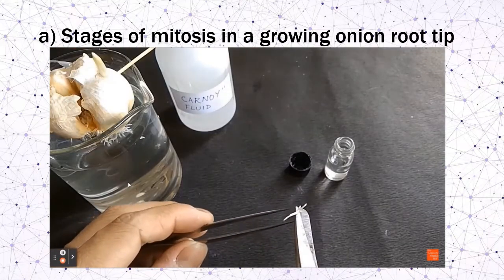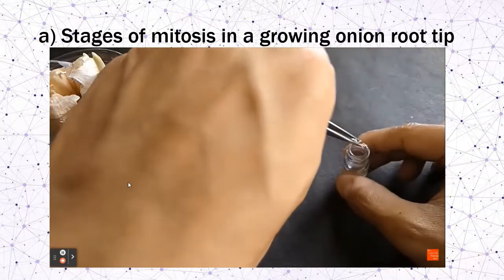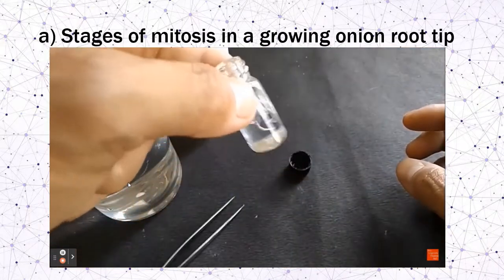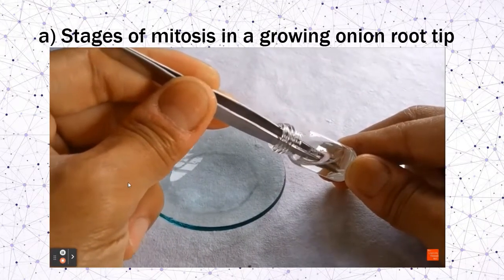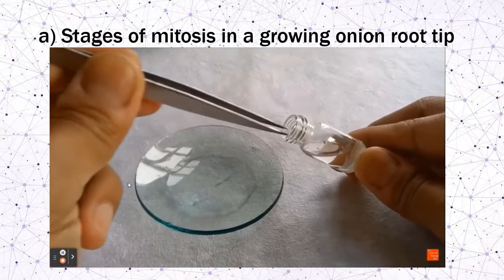Cut one centimeter of the root tip and put it inside the carnoid fluid. This carnoid fluid is used to stop the mitosis process. Leave it for about 48 hours before use. Then transfer the root tip into a watch glass containing hydrochloric acid. This acid will soften the cell wall and weaken the cellulose connections.